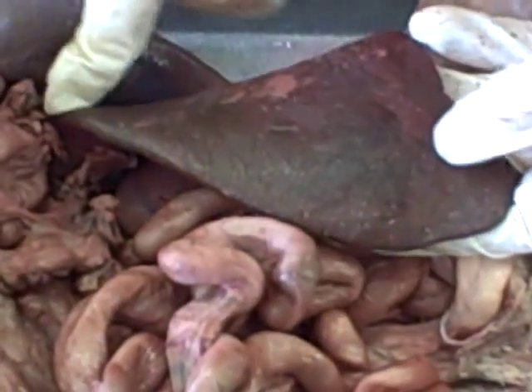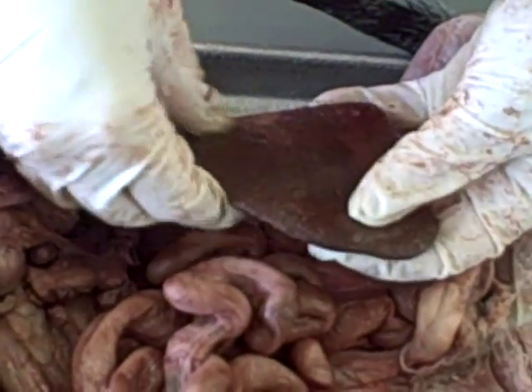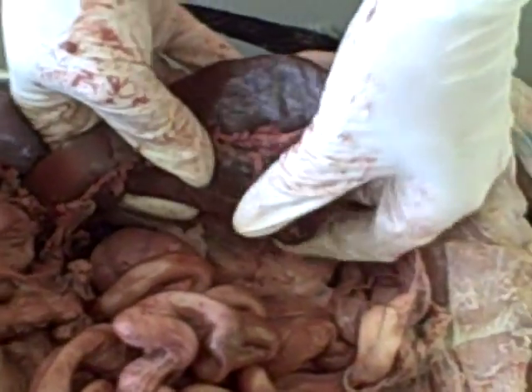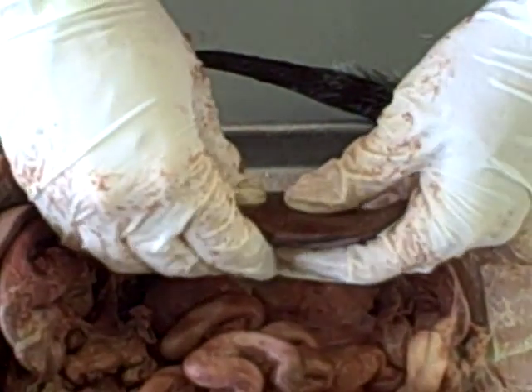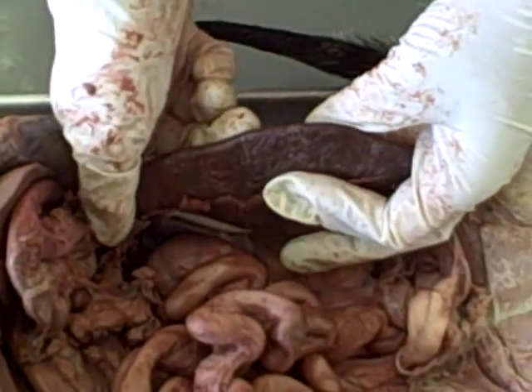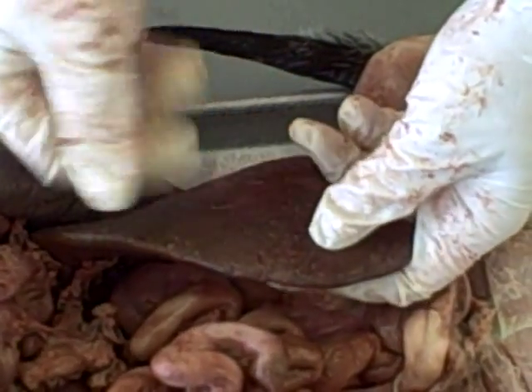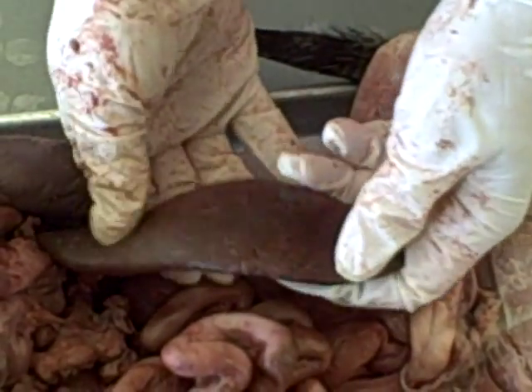The last organ here in the abdominal cavity is this large, very dark organ. It's off to the side, to the left side of the animal. It's a very dark, deep red. It's huge. It's very firm. There's something to be said about being able to dissect and touch the organs and feel, because remember, structure leads to function. This is very firm and dense, and it has vasculature that goes through, and it filters the blood and produces red blood cells and will store them. So it needs to be very firm and very strong.